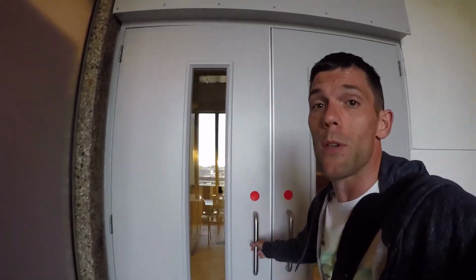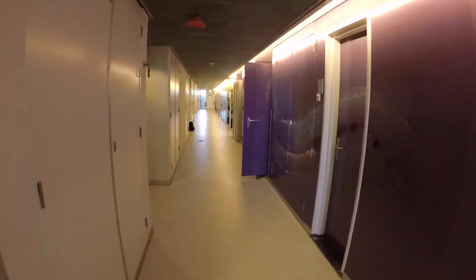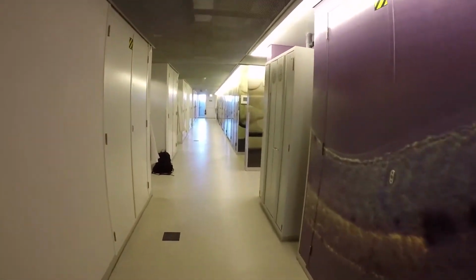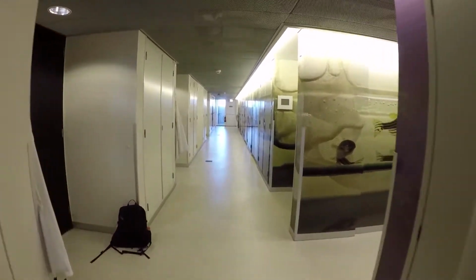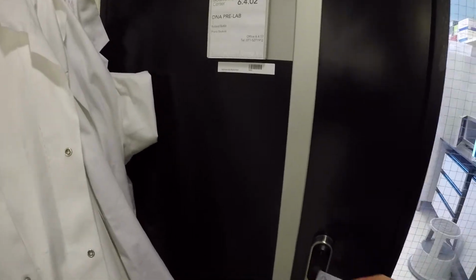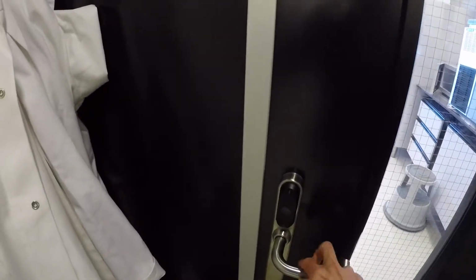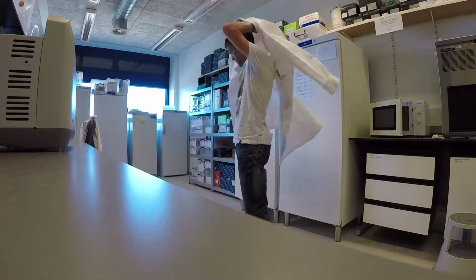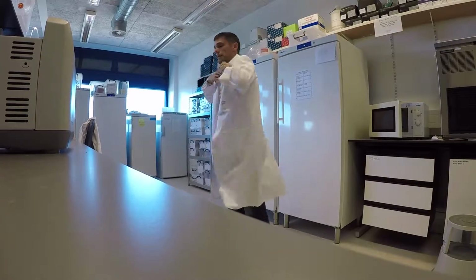Here is the Naturalis barcoding lab. So we have all facilities for DNA extraction and sequencing analysis. So this whole floor actually is full of labs. I don't come here that often, but all of our samples should be here. See if I can find them.